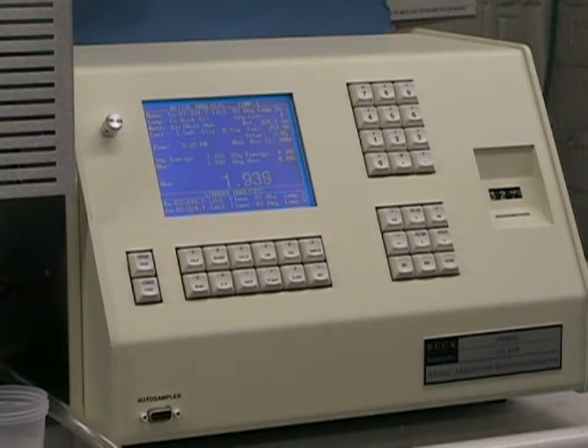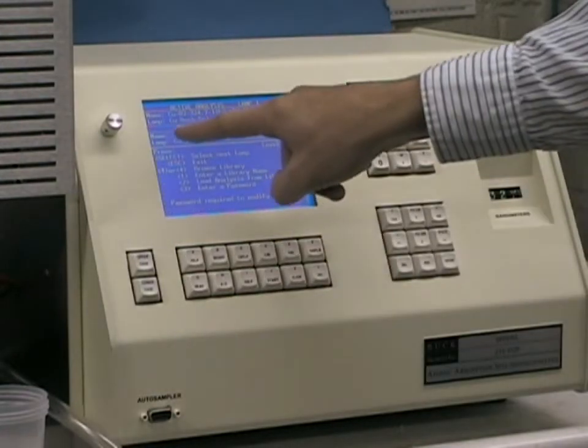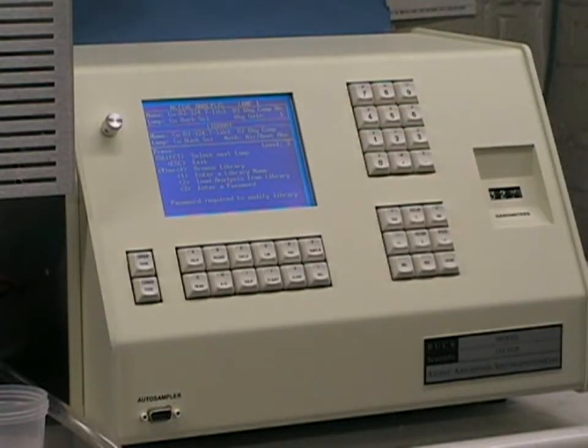Pressing the library key, you can see what element is loaded into lamp one. Since we're doing copper, and that was previously done, we're all set to do our alignment.